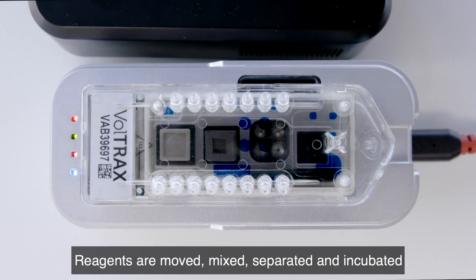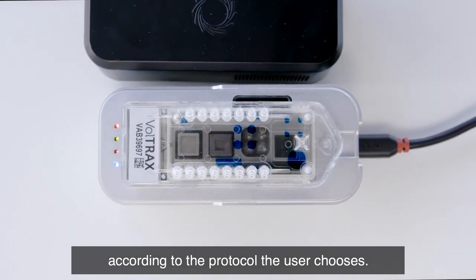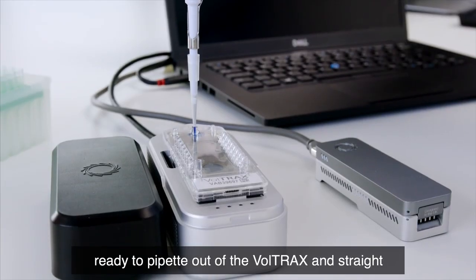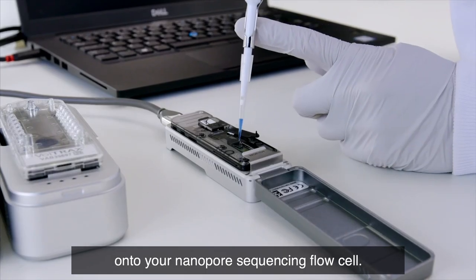Reagents are moved, mixed, separated, and incubated according to the protocol the user chooses. After the Voltrax run is complete, the pooled library sits underneath the extraction port ready to pipette out of the Voltrax and straight onto your nanopore sequencing flow cell.